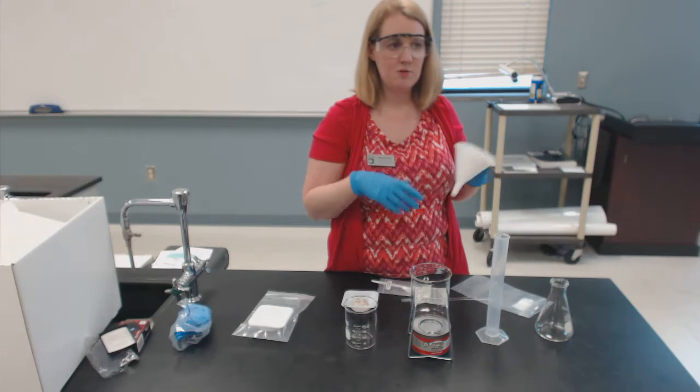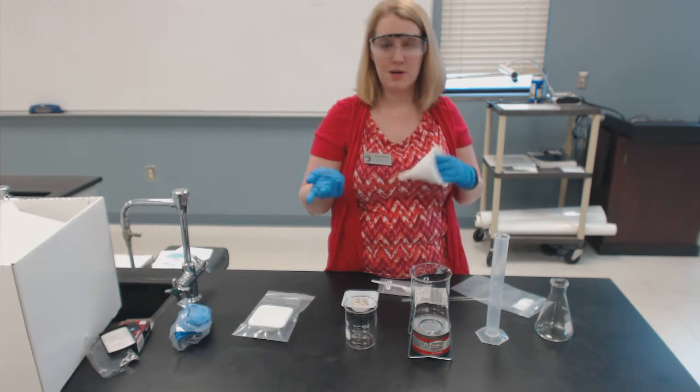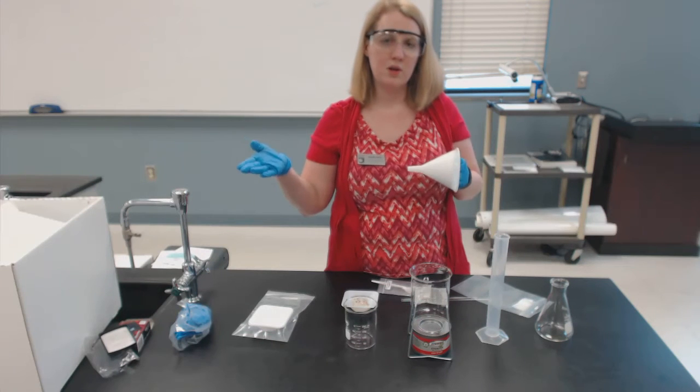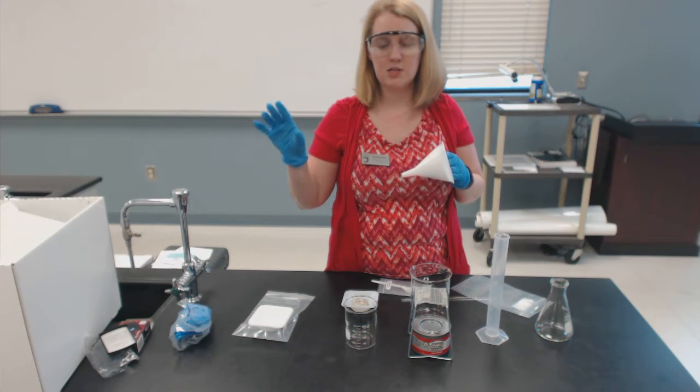Don't just say, step 7, record the mass. Well, record it as what? Record it as the mass of salt, sand, salt and sand, salt, sand, and ammonium chloride. Tell them what they're recording so that they know where does that go into the procedure, into the results section.